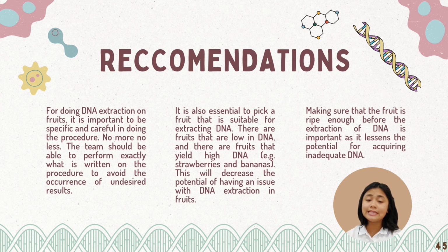Number 2, it is also essential to pick a fruit that is suitable for extracting DNA. Some fruits are low in DNA and some fruits yield high DNA. Examples of these are strawberries and bananas. Number 3, make sure that the fruit is ripe enough before the extraction of DNA, as it lessens the potential for acquiring inadequate DNA for the experiment.